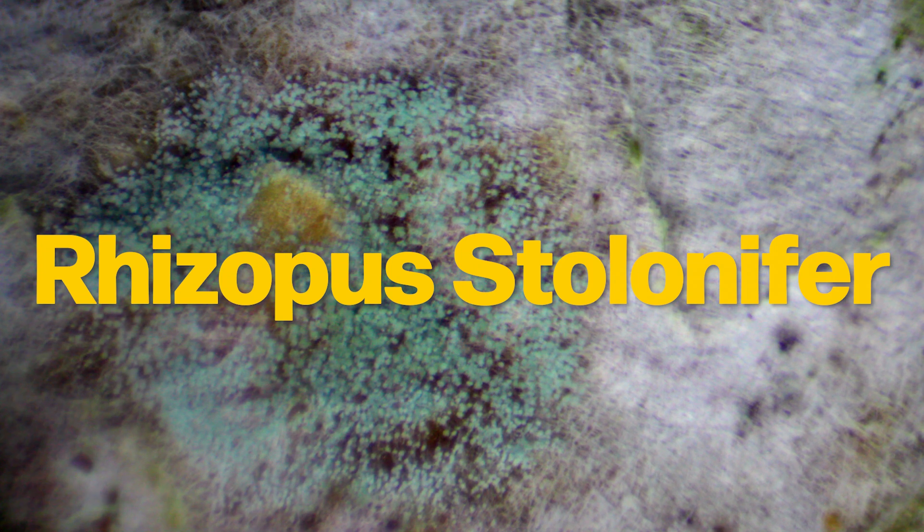Let me introduce you to Rhizopus stolonifer — an expert on decomposing bread.